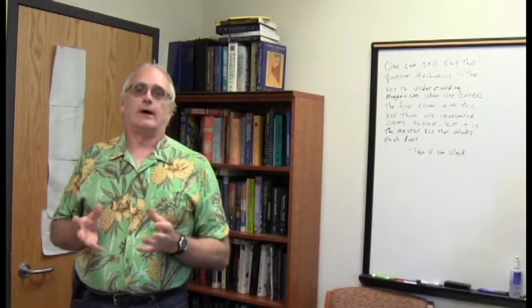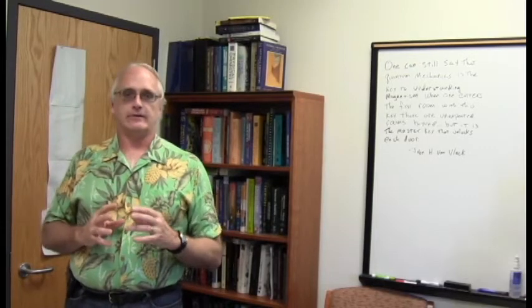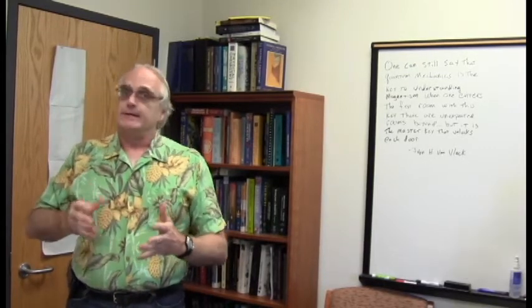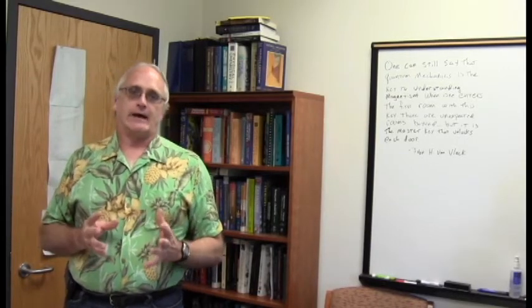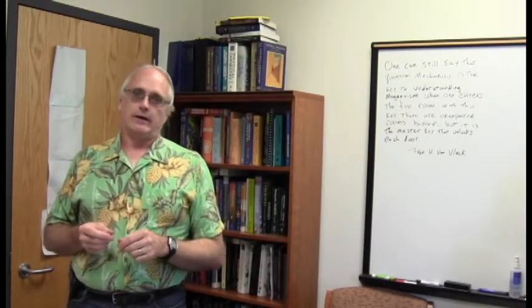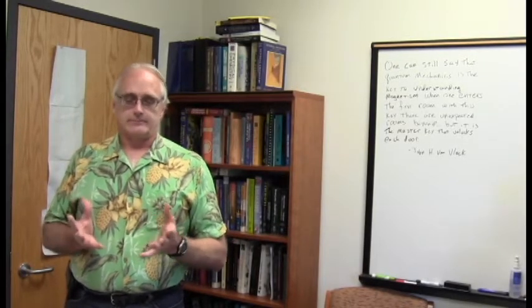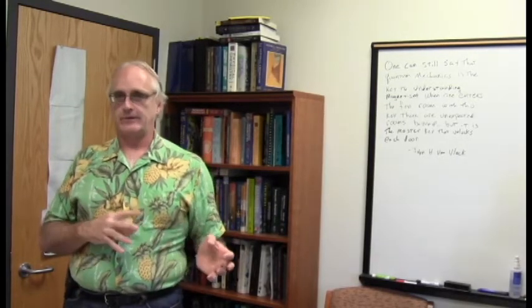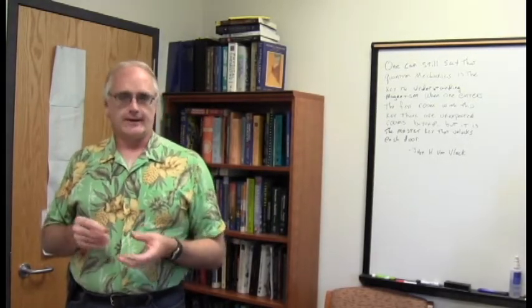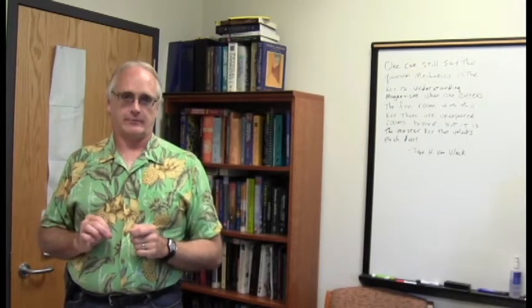And let's face it, while it is compelling and fascinating to watch me solve one of these unknowns, ultimately it's going to be your job to be able to apply all of these ideas and start learning about unknown chemical structures on your own. So here's using this as kind of a nice worked out example from start to finish of figuring out the structure of an unknown based upon multiple NMR spectra.